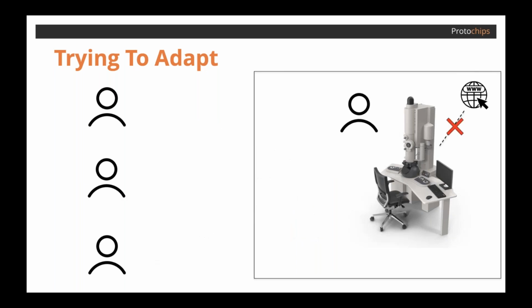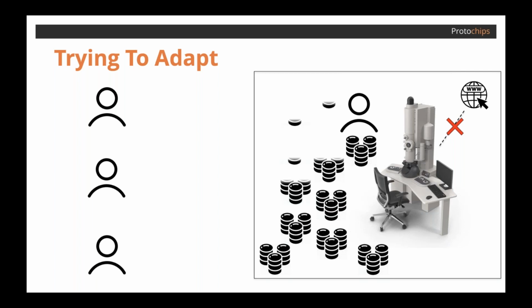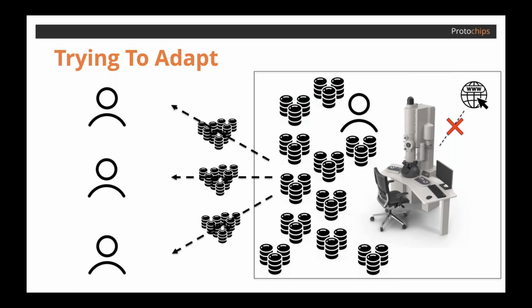In addition to the experiment setup, there's a huge challenge with data transfer as well. Cameras these days are spitting out terabytes of data in the blink of an eye, and not everyone's set up to transfer and receive that amount of data in their office or their home. Things like internet bandwidth, computer space, and compatibility with different post-processing software can limit what the researcher can receive from the TEM operator and ultimately what they can do with that data. And this part, the data transfer, can be almost more frustrating than the setting up of the experiment itself.